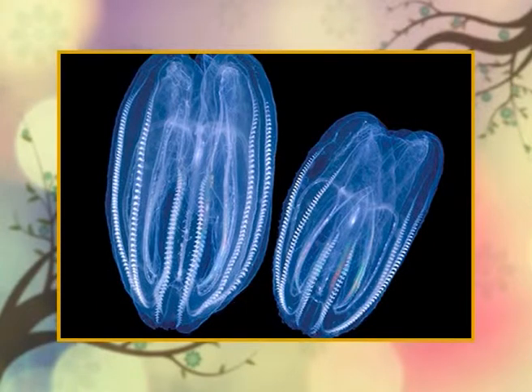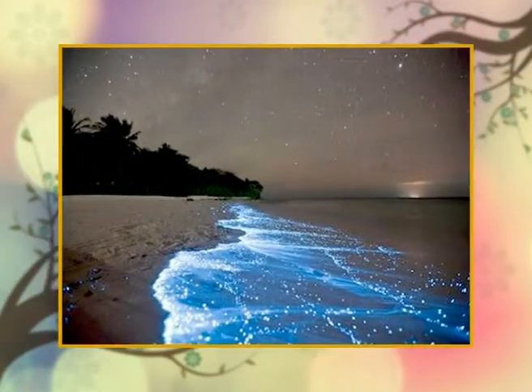Phosphorescence is a similar but slower luminescence phenomenon in which the excited molecules go through an intermediate excited triplet state, from where light is emitted by returning to the ground state. The instrumentation and spectral region for measurement of phosphorescence are almost identical to fluorescence spectroscopy.